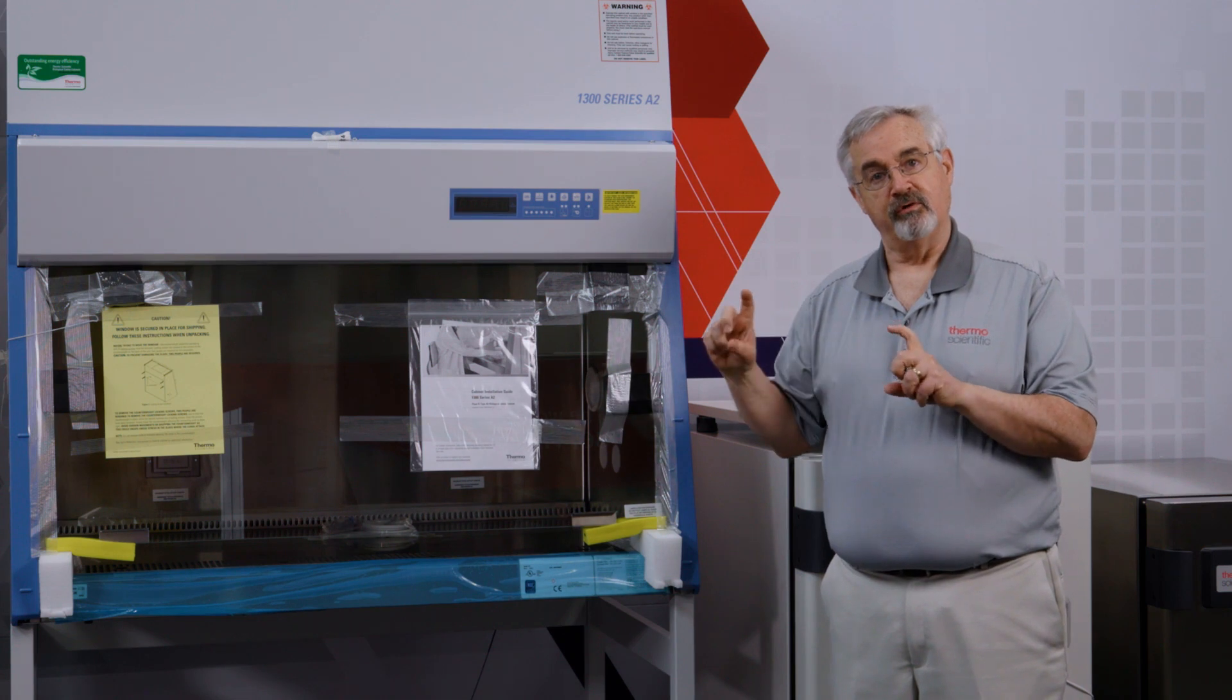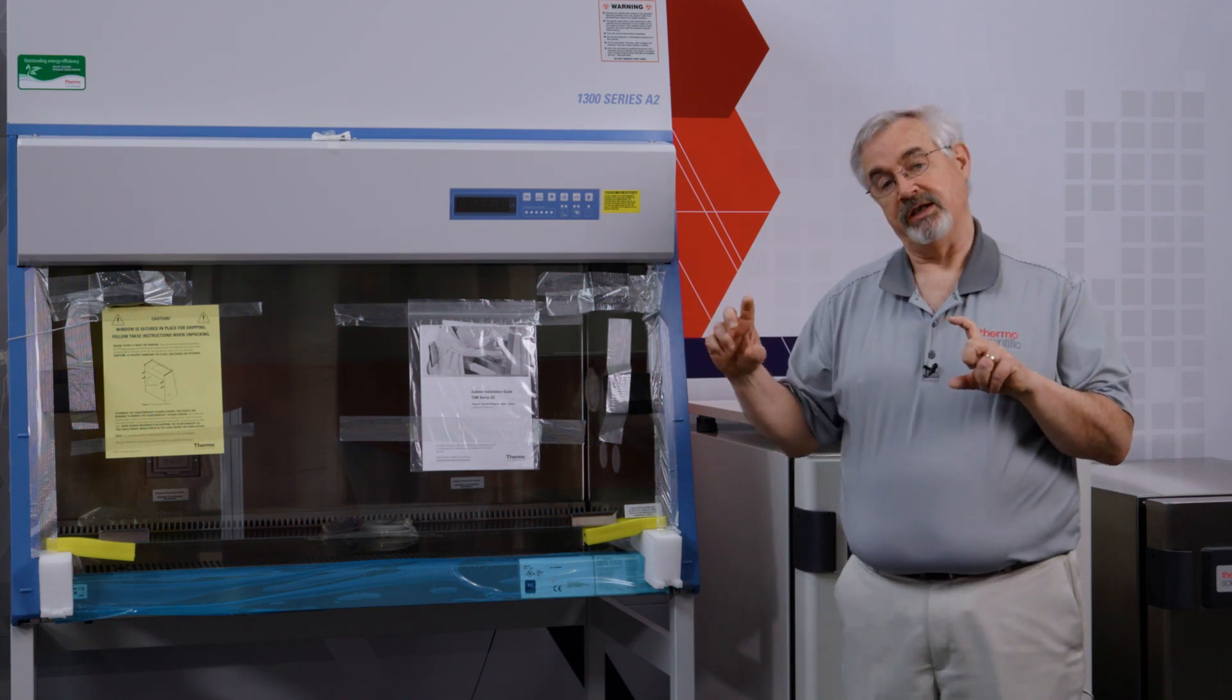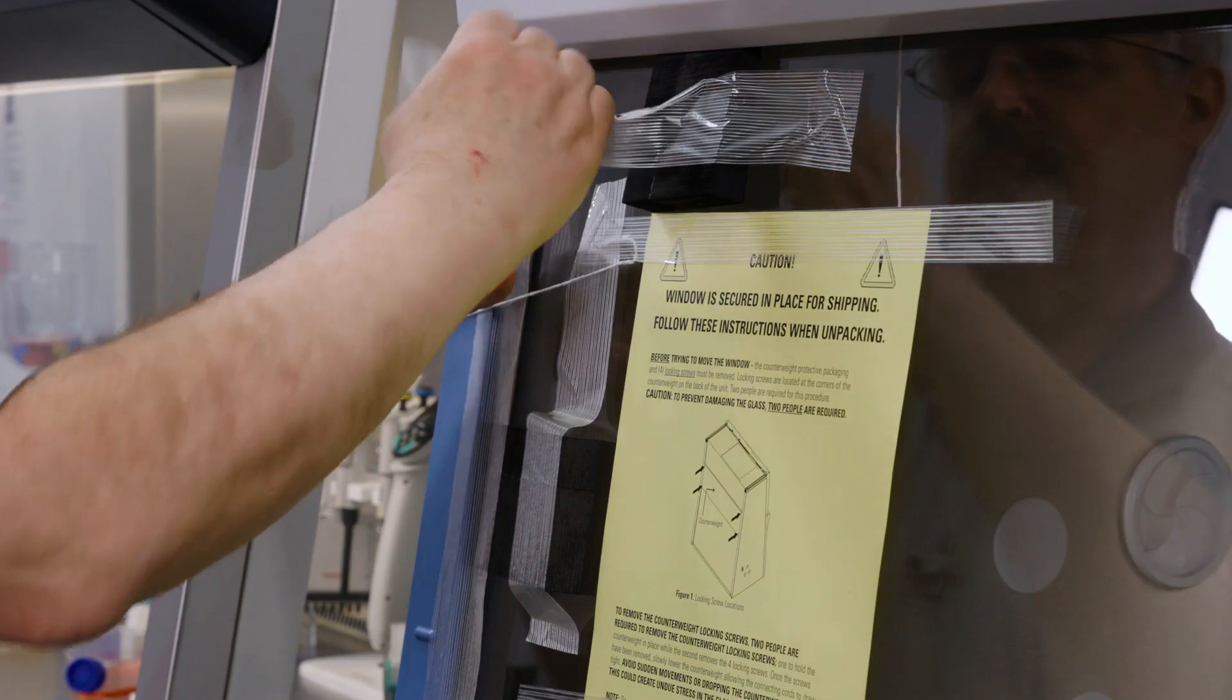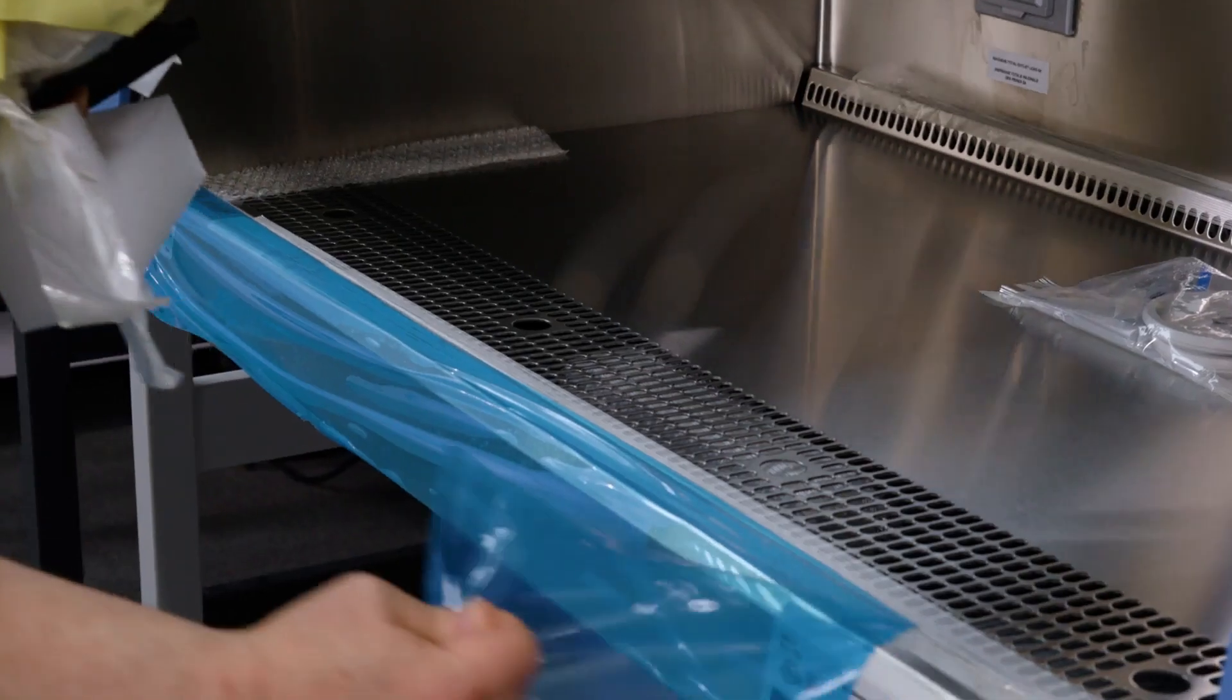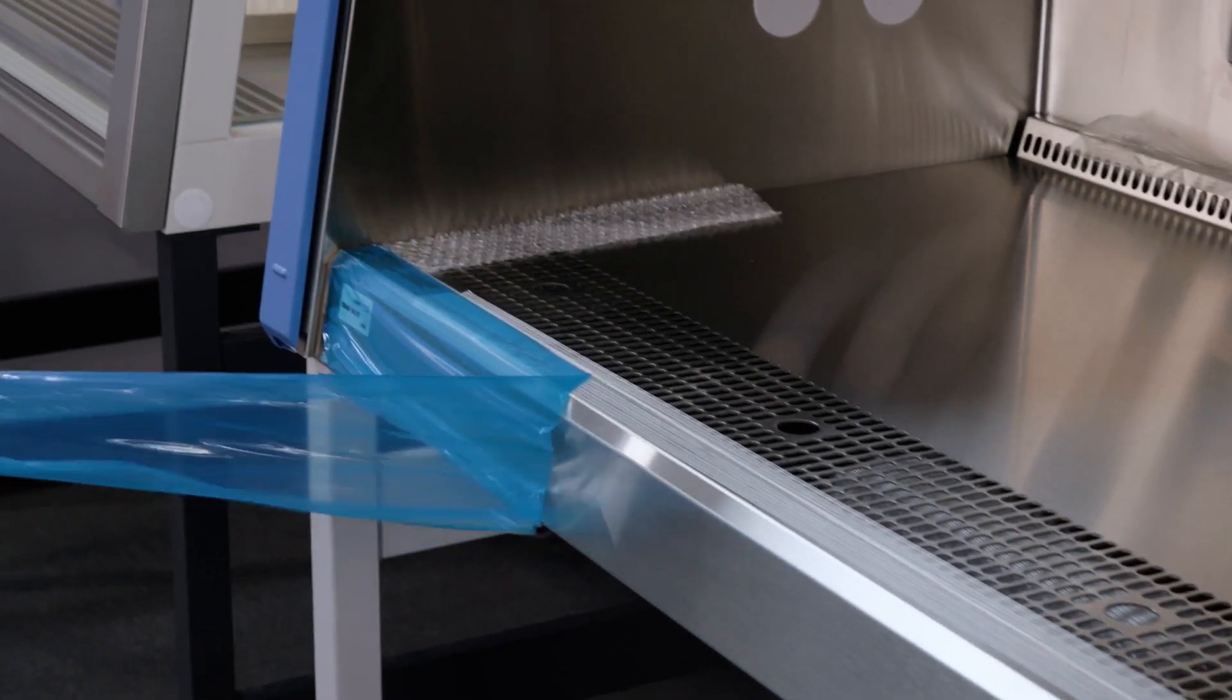We have removed the four screws holding the counterweight into place for shipping. So what we're going to do now is remove this packing material on the front of the cabinet and we'll move on to the things we'll find on the inside and we'll also attach the drain valve.